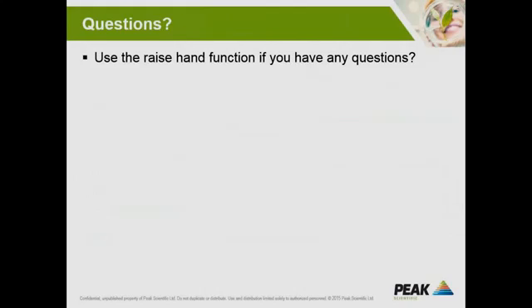The next question was on the longevity of filters. As Ed touched on, with routine maintenance it's generally every 12 months. So for the nitrogen, the zero air, and the compressor, filter changes are required every 12 months.